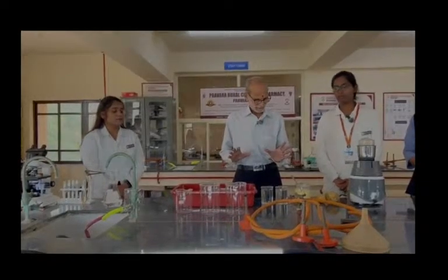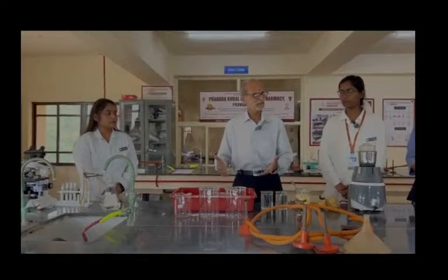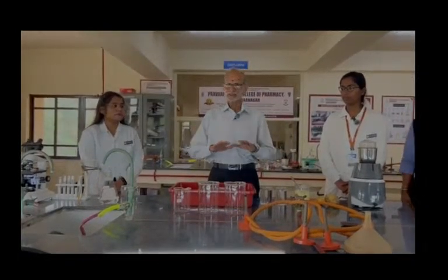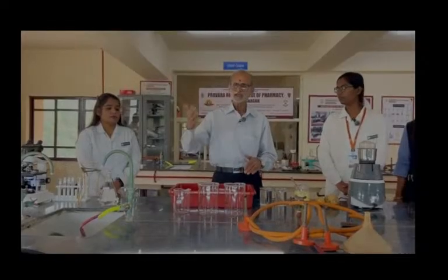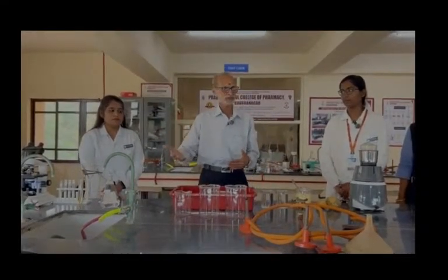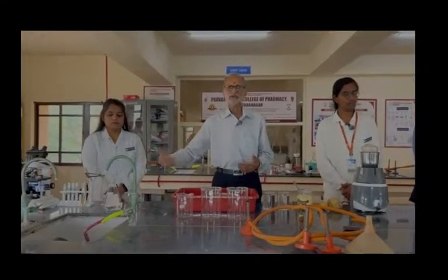Okay, so we are going to pass it through the mesh. Whatever gets passed through that will be the starch. Then we'll pass it into the beaker. We will allow the starch to settle down, which is heavier, and we will decant the supernatant, and thereafter we will give it washing. Just one more washing with the water, and thereafter we will try to dry it along with the solvent.